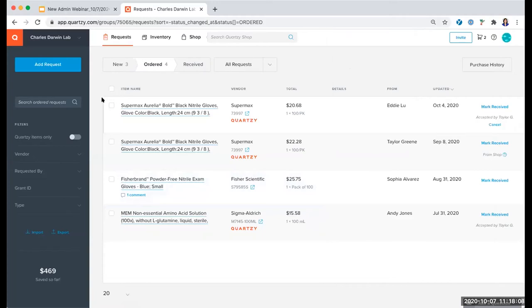The last section in the request module is on the left sidebar — we have our search and filtering area. This will help you narrow down the results so you only see what you care about. You can filter by vendor, requester, grant ID, and type. You can also filter for just the items that were ordered or requested from Quartsy, and there's a general search box. That was another stopping point — we haven't talked about ordering yet, but anything else about requests? No other questions.